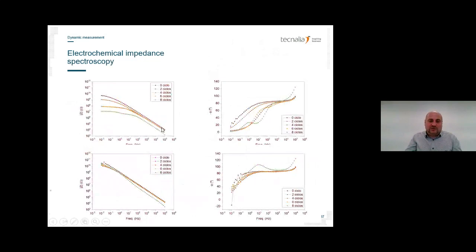We can see also if there is just one variation, for example like this one, or various variations. Here we can see that there are various variations, so things happen. In a coating, what typically happens, for example in this case, is that water is going inside, and water has a specific property called the electric permittivity. The electric permittivity of water is very high compared to the electric permittivity of polymers. The penetration of water is going to affect a lot the capacitance associated with the coating. So we can see very clearly when water is entering, and we can even calculate how much water enters the material if we know the thickness at the moment of the measurement. That's also very interesting information. So we can extract quite a lot of things from impedance when we start to treat the data seriously.